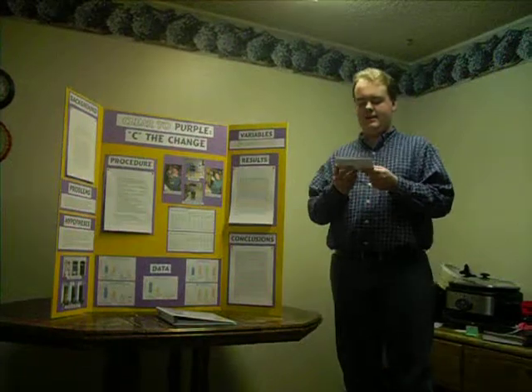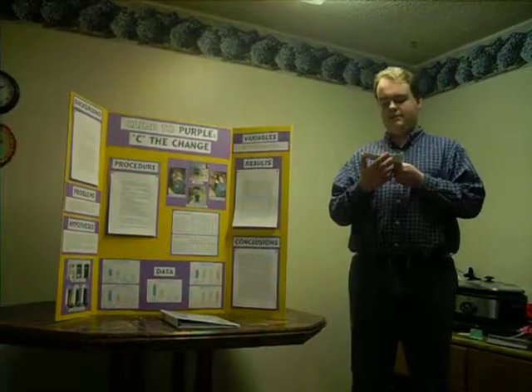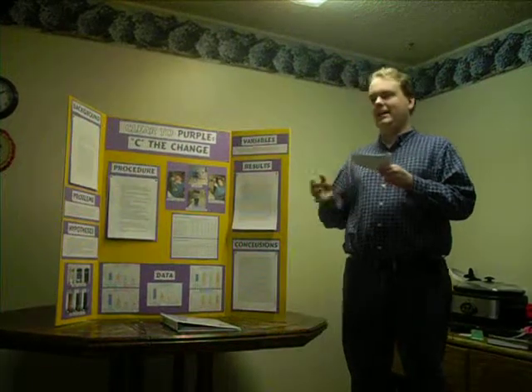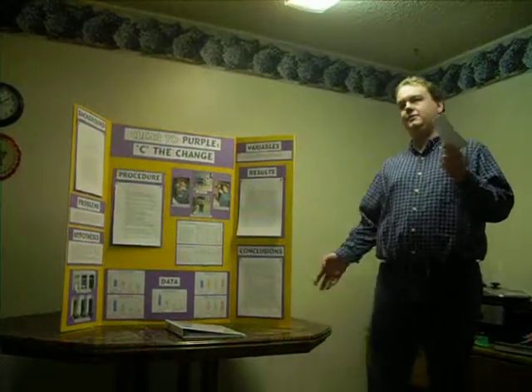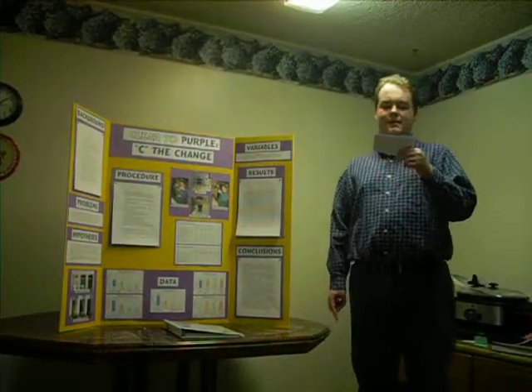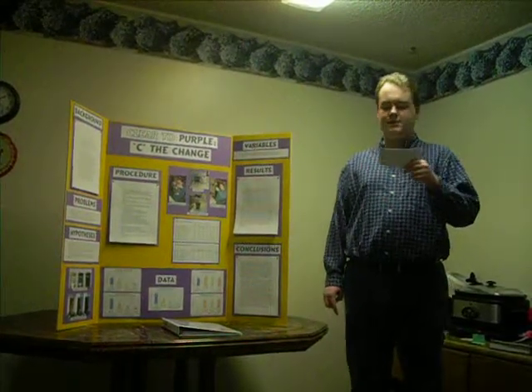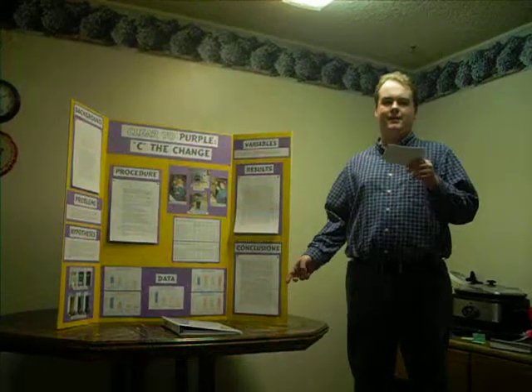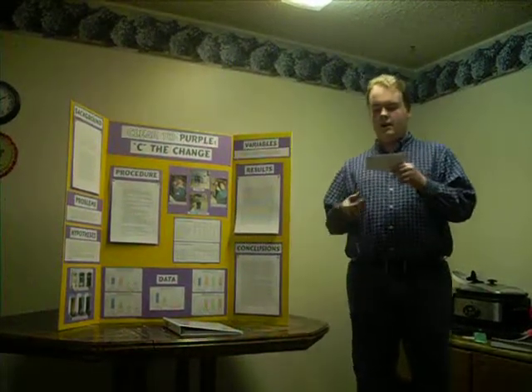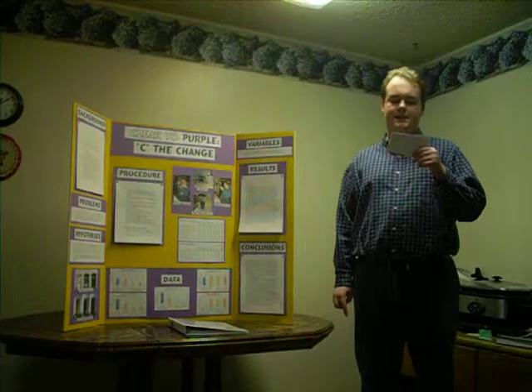For the second experiment, I likewise designed this experiment with the help of guidelines. First of all, I labeled 2 cups A and B as I did last time. To A, I added 10 milliliters of water, 1/2 a scoop of sodium iodate, where a scoop is approximately equal to 0.2 milliliters, but I did not calculate it all out. Then a scoop of sulfuric acid.